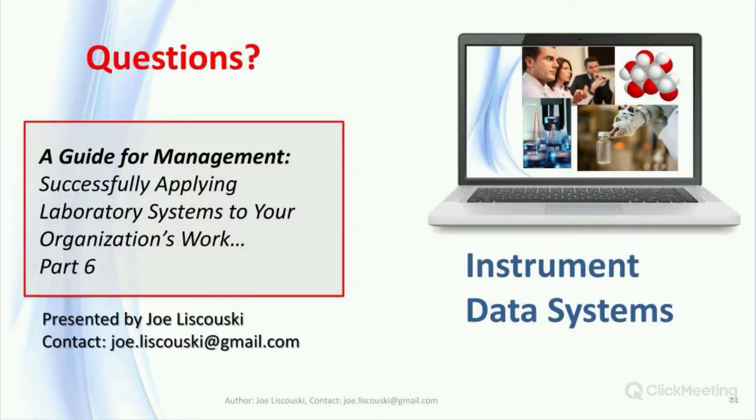It means that we have to prove that the tools we're using work as we need them to and are appropriate for our requirements. And that's where we're going to pick up the discussion for the next webinar, which is currently slated for June 21st.